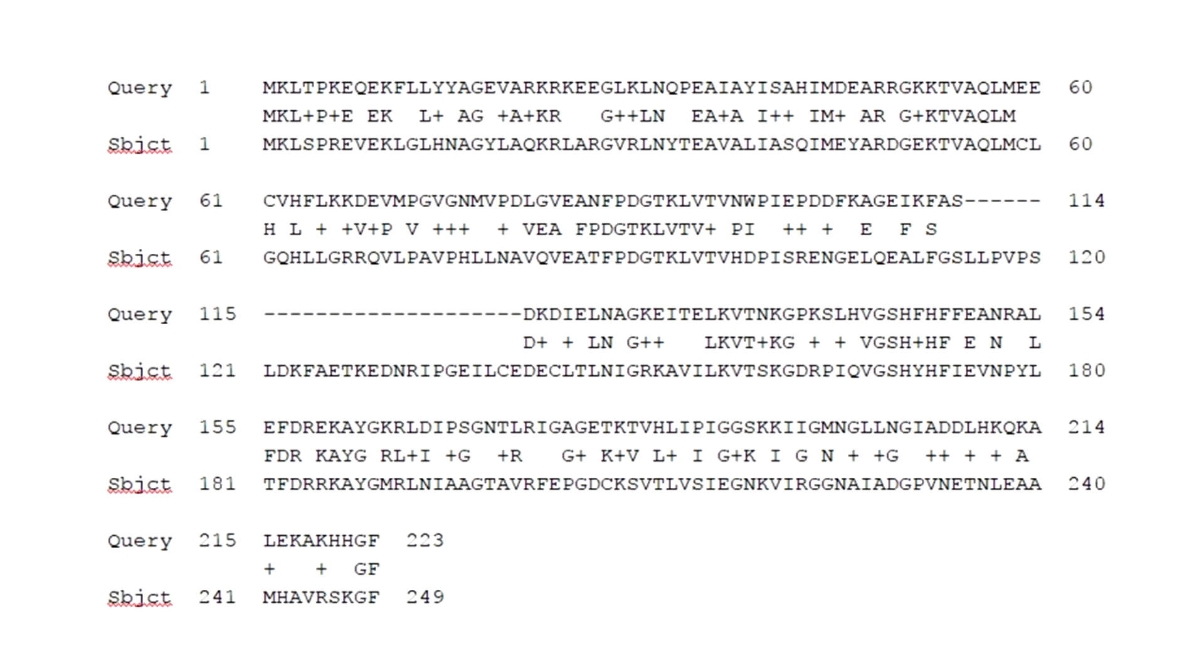The centered line provides the following information: A letter designates an identity between the two sequences. A plus sign means the two sequences are similar but not identical. If no symbol is given, then a non-similar substitution has occurred. Gaps are also introduced in the alignment.